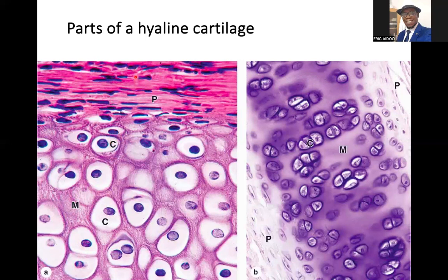So that is perichondria with the perichondrial chondroblast. Then you have chondroblasts emerging from the perichondrium, and these chondroblasts will keep on growing towards the middle portion. So new ones will be laid down from the perichondrium here, and then old ones will be migrating towards the middle portion to grow and hypertrophy, and become chondrocytes. So again, you can see here you have perichondrium on one side and then perichondrium on another side.